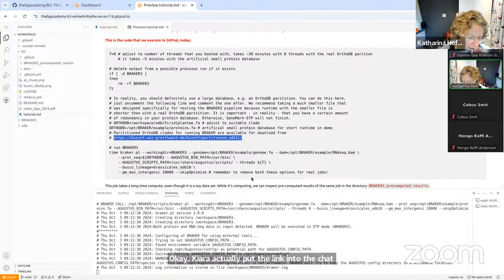To use protein databases for species that are more or less closely related, in the absence of reference proteins, is it better to use the RNA-seq libraries directly, or to assemble them, pass them through TransDecoder and obtain proteins? No, no, no. Don't assemble them and pass them through TransDecoder.